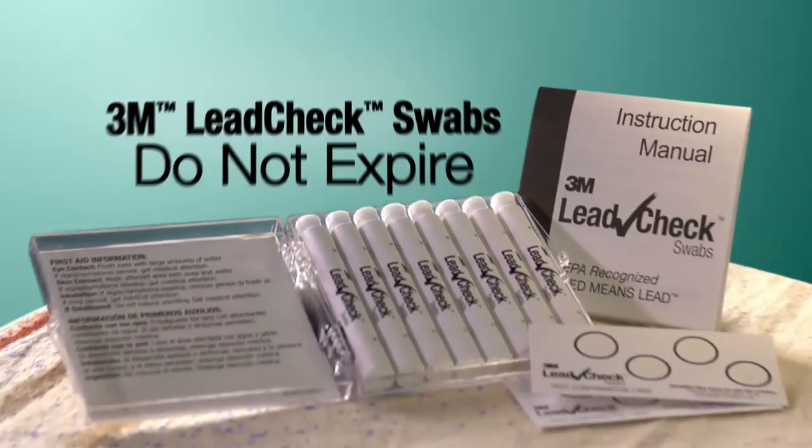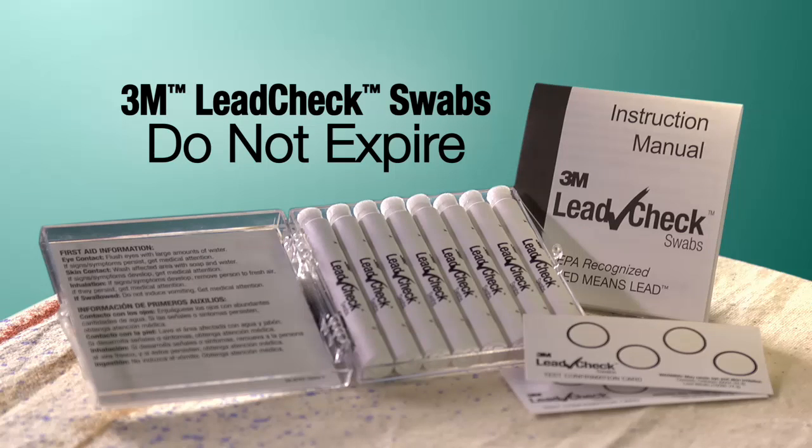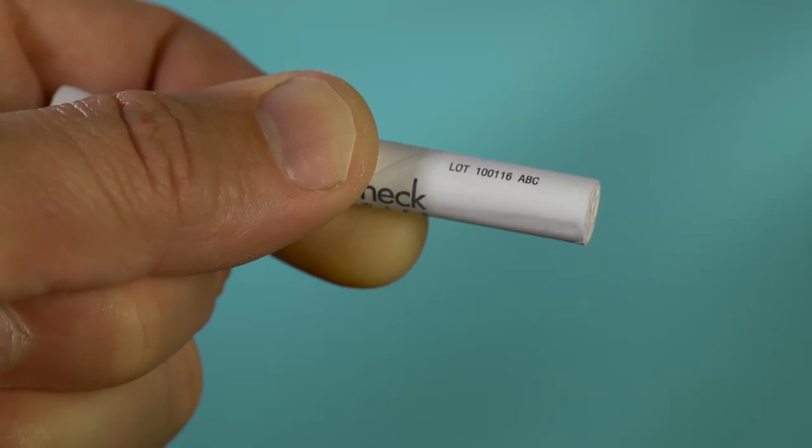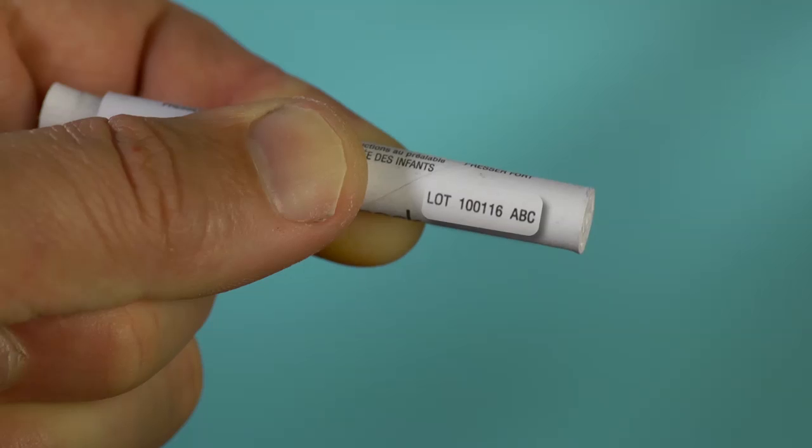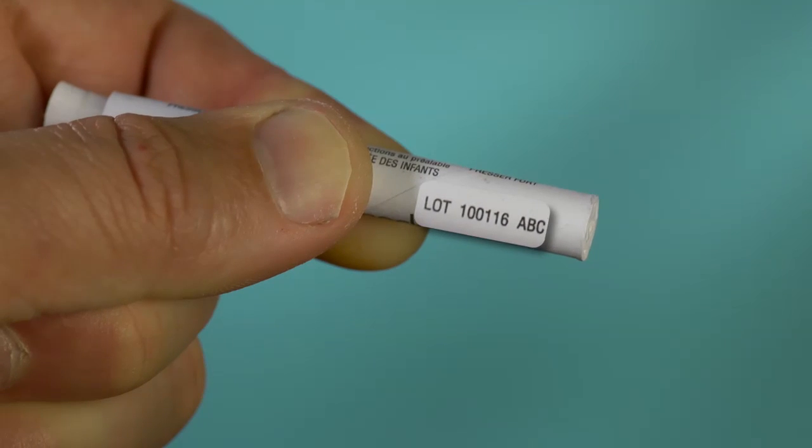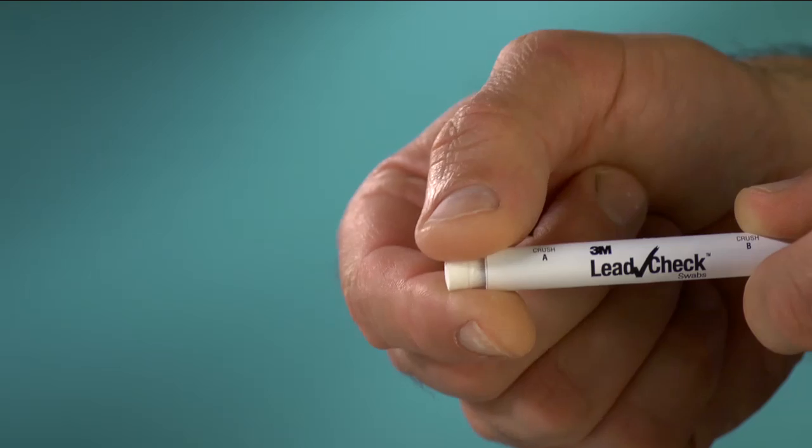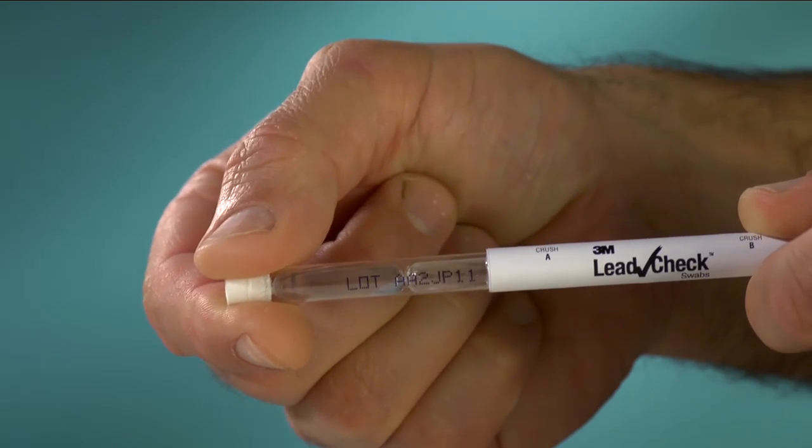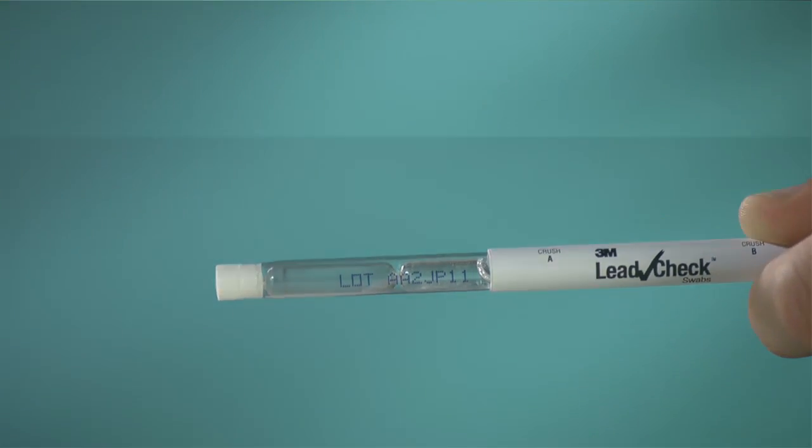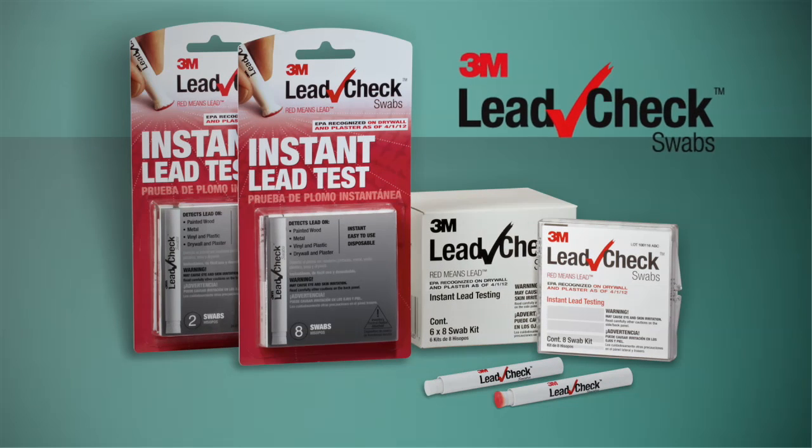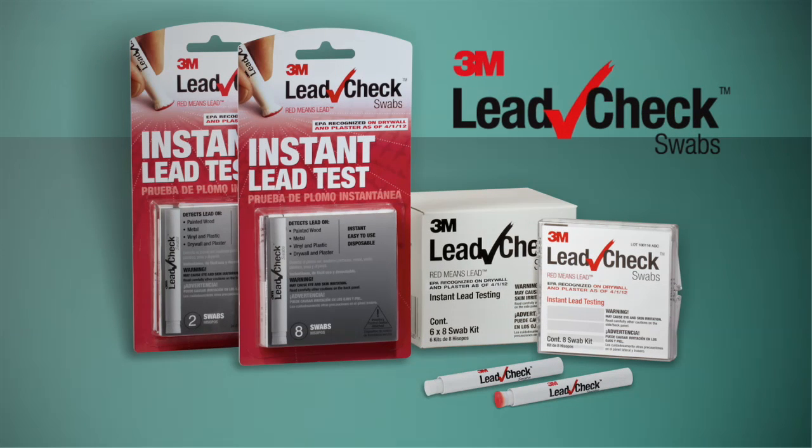3M LeadCheck swabs do not expire, so when filling out the EPA form, use the lot number shown on the swab in the expiration date field. The lot number can be found on the cardboard cover or on the plastic tube underneath the cardboard cover.